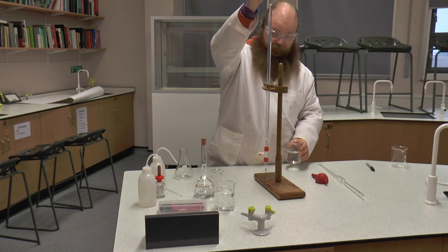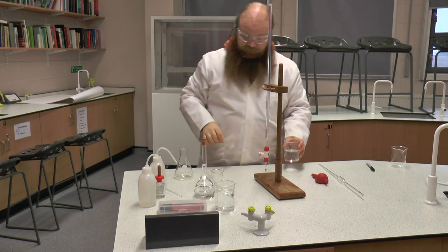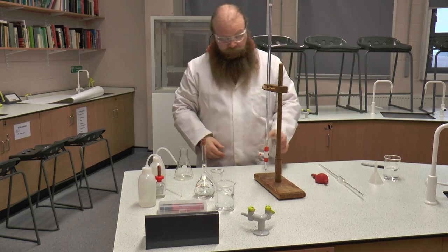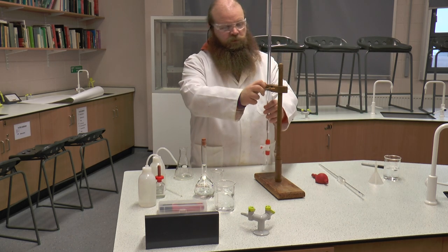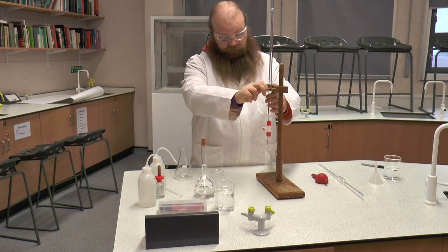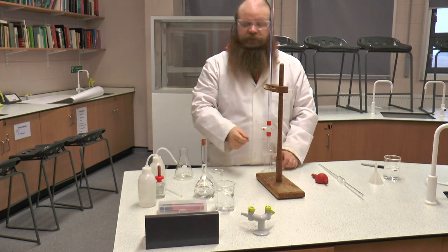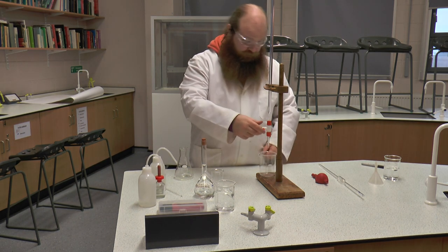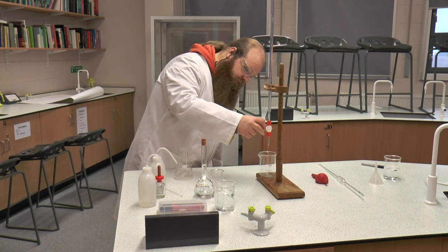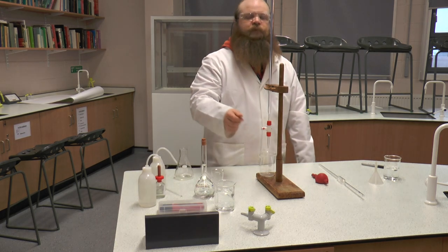Now I have filled up my hydrochloric acid. I'm now going to take another beaker because, although I filled it up and it's slightly above zero, there will be slight air bubbles in the tap. So I'm going to run some of the hydrochloric acid out to make sure that all the air bubbles have been removed.